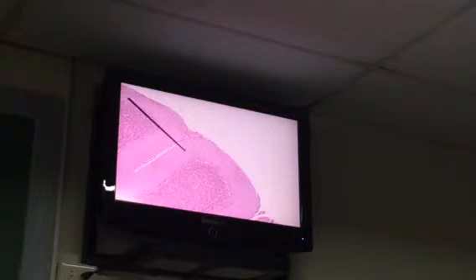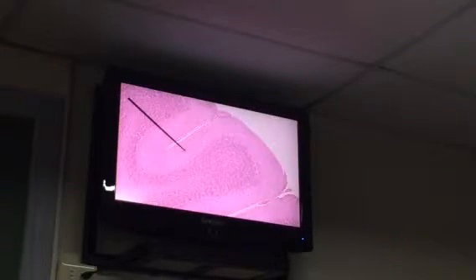Next slide. Next slide is number 98. That is the cerebellum. So this is the cerebellum. Again, take note of the bulges. These are of course again gyri, cerebellar gyri, and your cerebellar fissures.